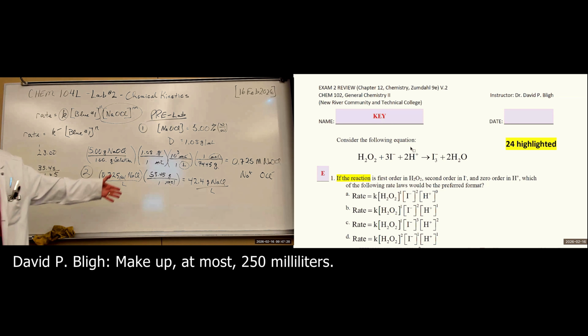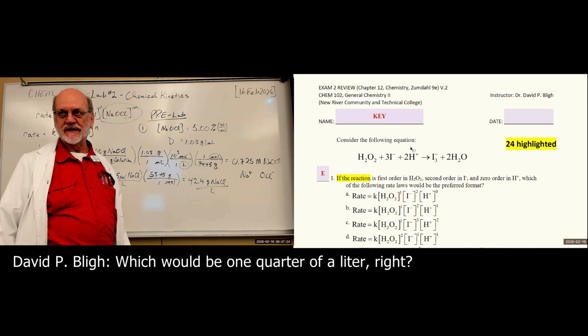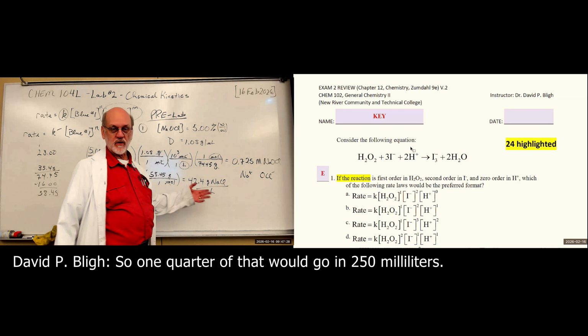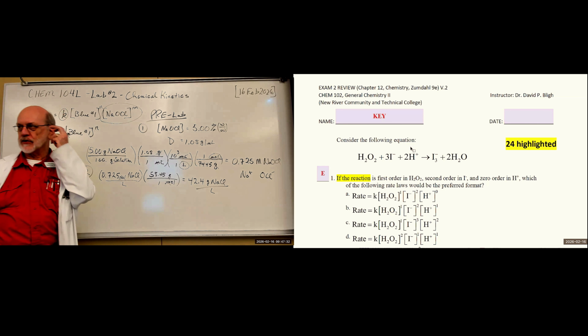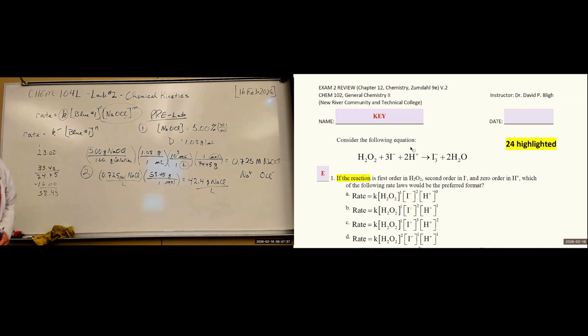Now, I'm not going to make up a liter of that. Make up at most 250 milliliters, which would be 1/4 of a liter, right? So 1/4 of that would go in 250 milliliters and give me plenty to last for several years. Okay, that's number two.